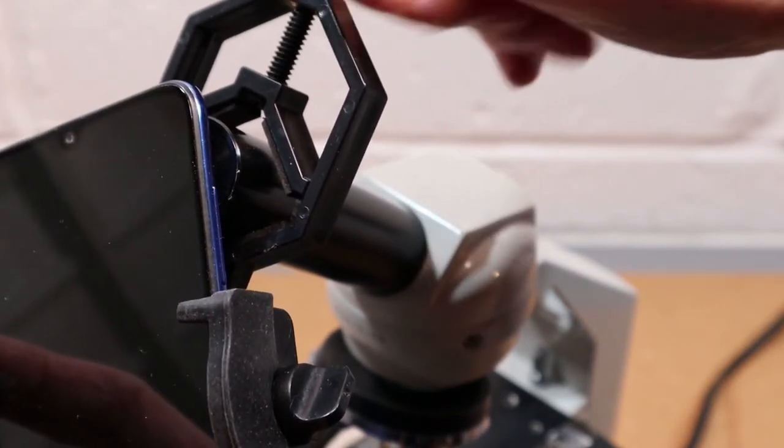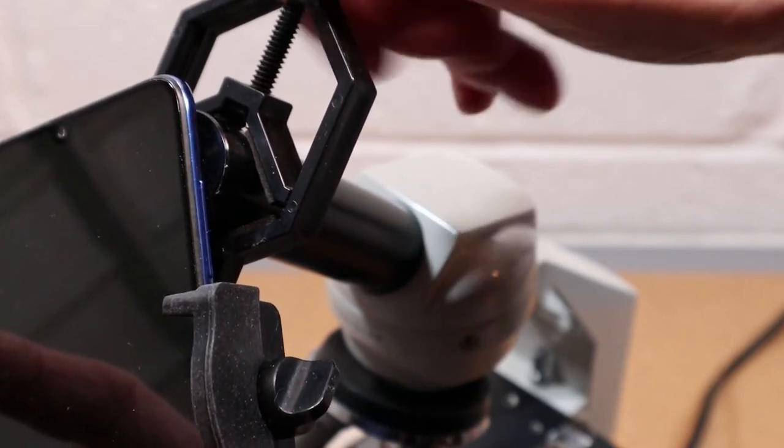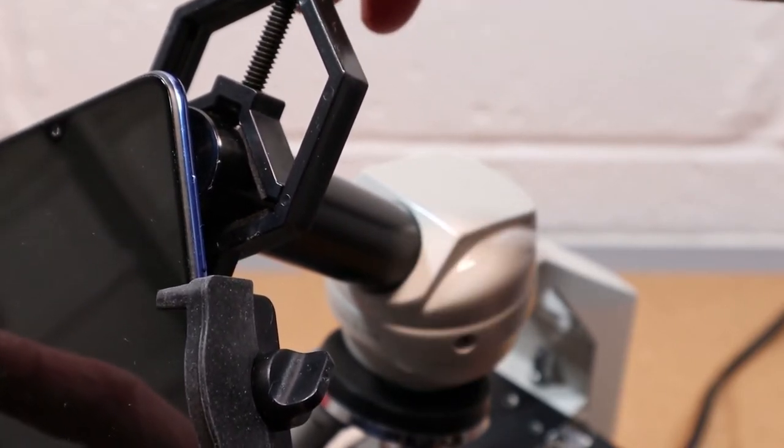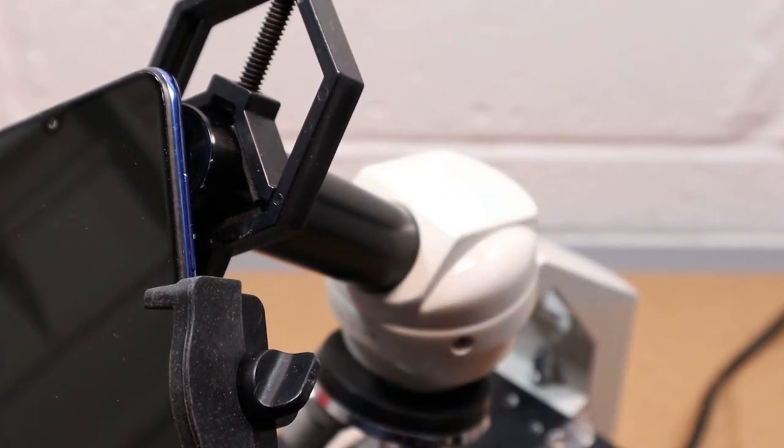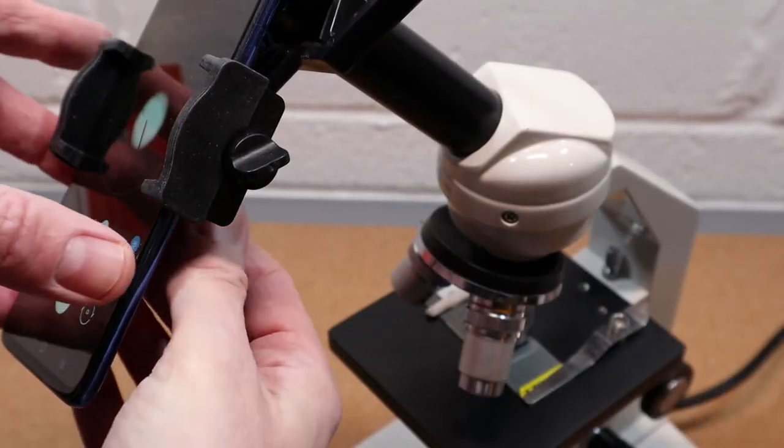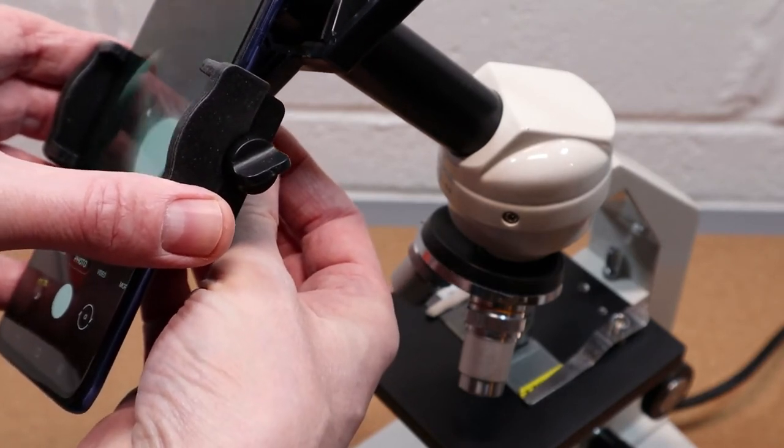One thing I was a little concerned with was that the eyepiece was made of metal and I didn't want to scratch the glass covering the lens in the phone. Maybe I could have placed a little foam ring over the microscope's eyepiece to avoid this. The final step is to slacken off that dial in the back of the adapter to perfectly align the phone's lens with the centre of the eyepiece.